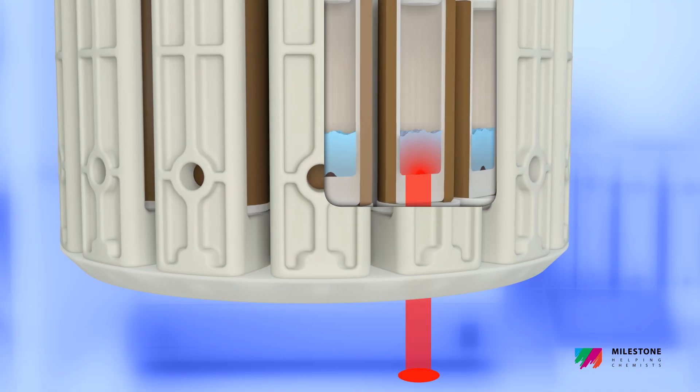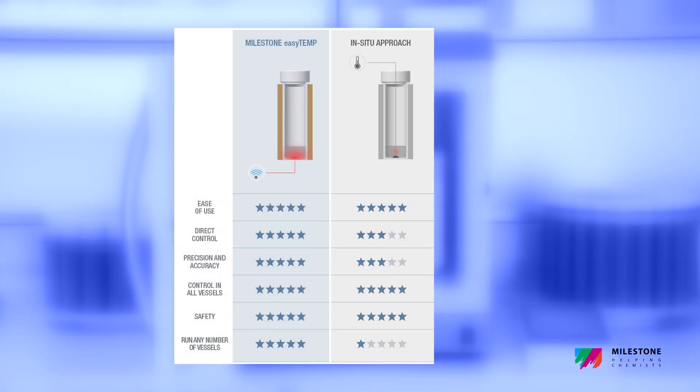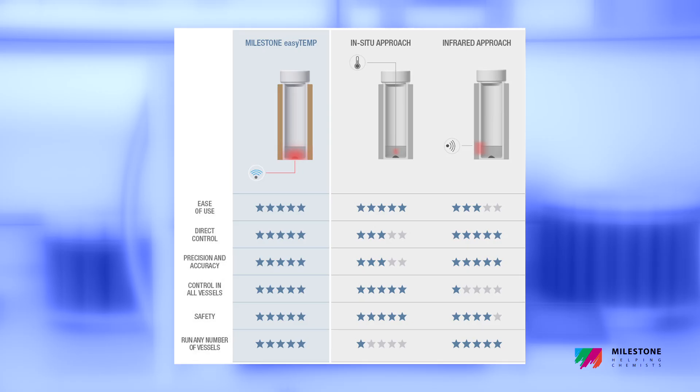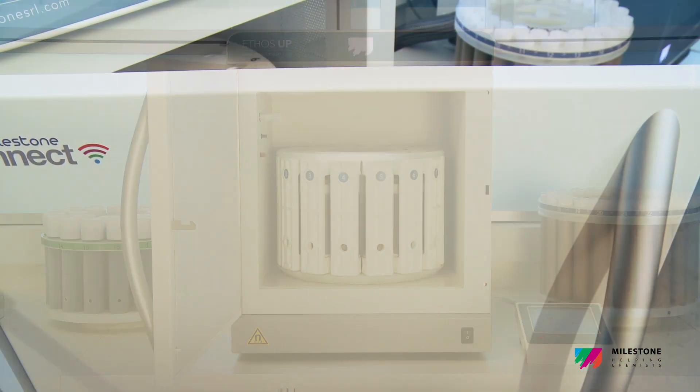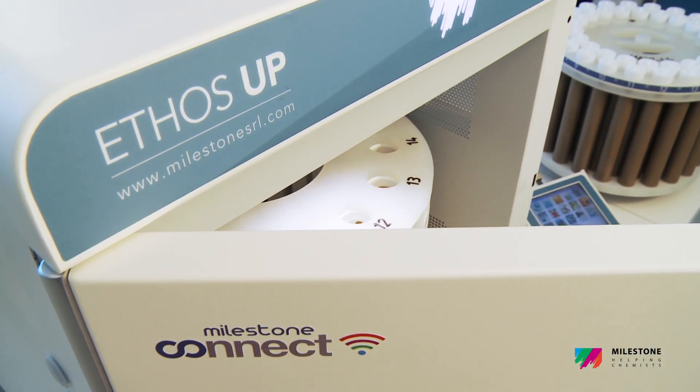EZTemp technology combines the fast and accurate reading of an in-situ temperature sensor with the flexibility of an infrared sensor, which along with the Ethos UP software provides digestion traceability and temperature measurement for every sample.